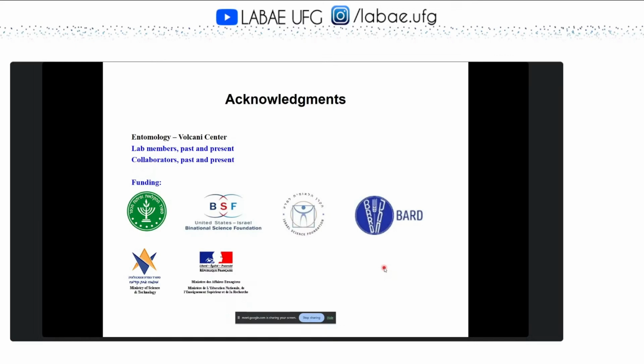Different molecular probes: almost every gene or protein you want to work with, there are antibodies, and antibodies that cross-react even from different species with your species. And I think people are now recognizing these methods more and more. And you always need to do microscopy before doing many other things.